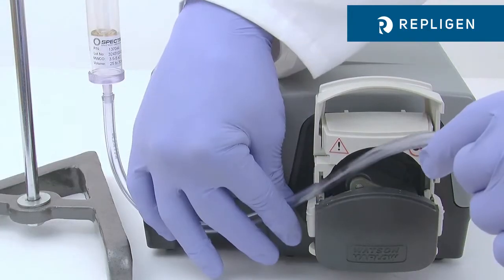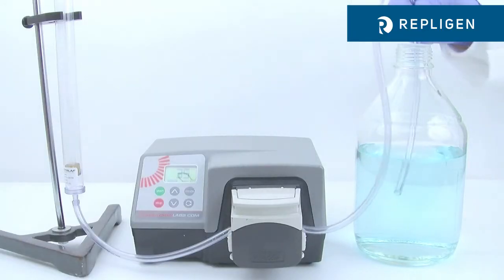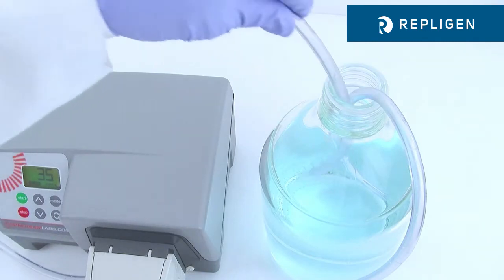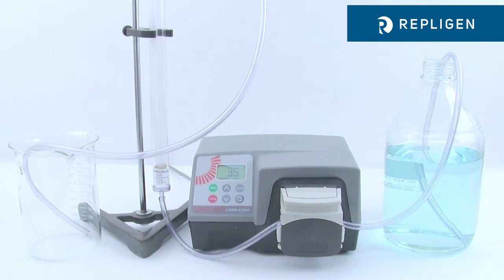Thread the bottom inlet tubing through a suitable peristaltic pump and connect to the dialysate or buffer feed source. The upper outlet tubing can be connected to the feed source for buffer recirculation or directed to drain for single pass.